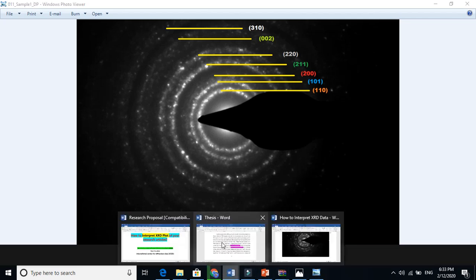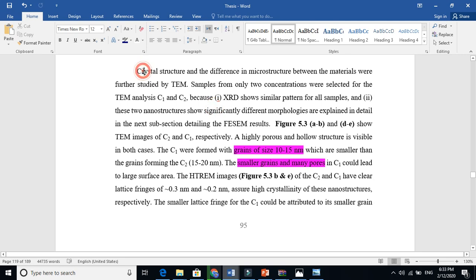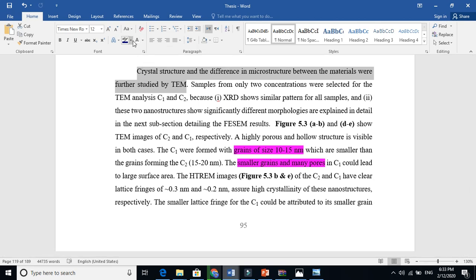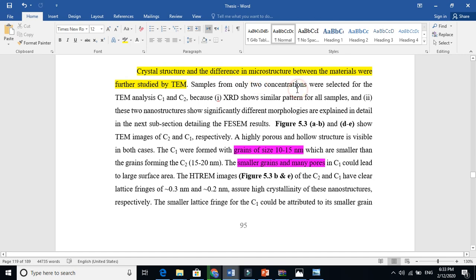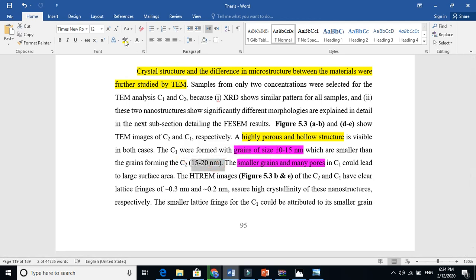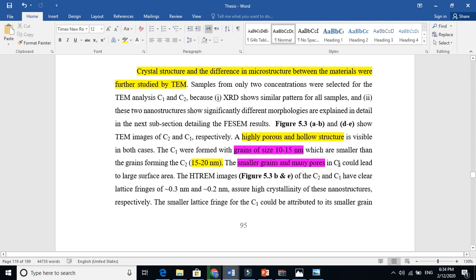Now let us see how to write about TEM in a research article. The crystal structure and differences in microstructure between materials were further studied by TEM — meaning we are using both XRD and TEM. TEM images of two concentrations show a highly porous and hollow structure is visible in both cases. One concentration formed grains whose size can be found using the ImageJ tool — the grain or crystallite sizes are 10 to 15 nanometers, which are smaller than the grains formed in concentration two. Smaller grains and more pores in the first sample could lead to a larger surface area.